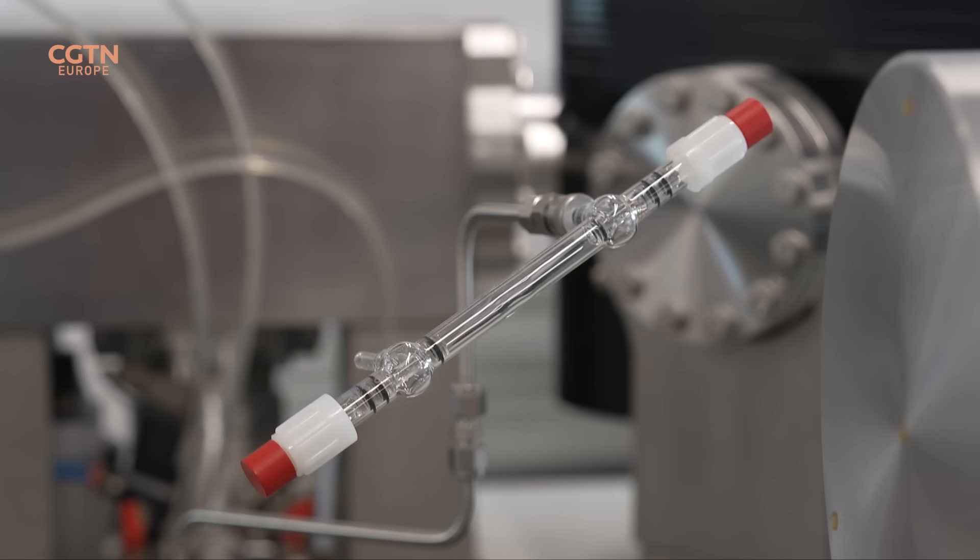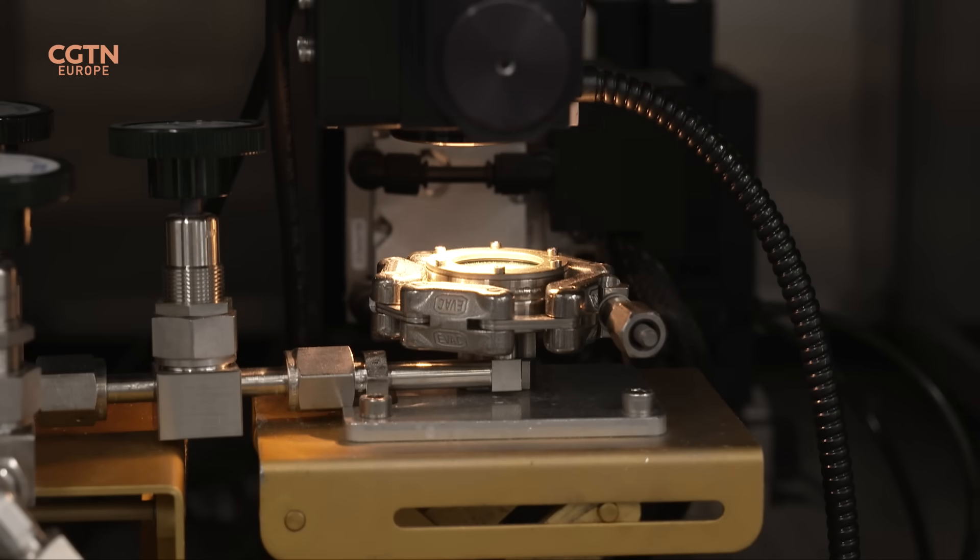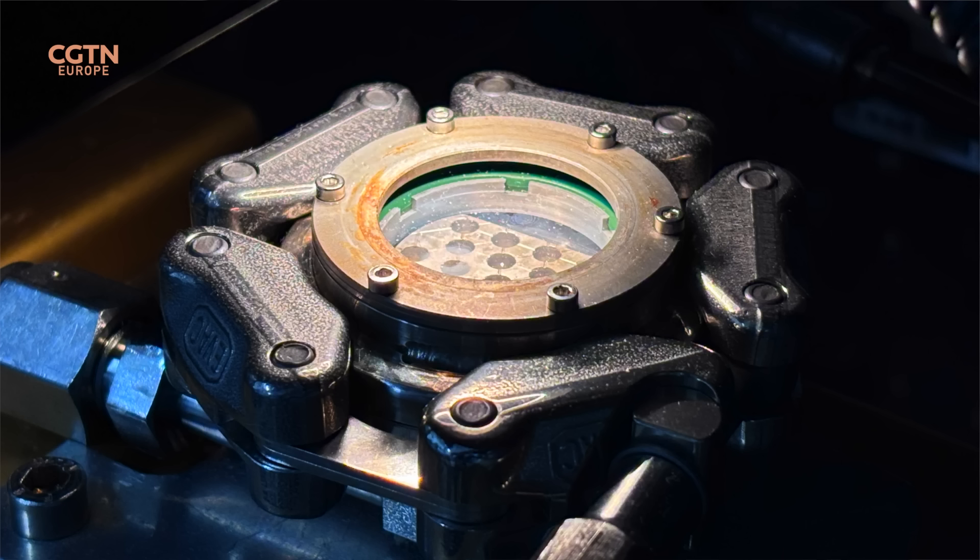In short, what it does is it introduces small amounts of moon dust and reacts that moon dust in the presence of a chemical compound called Bromine Pentafluoride. You use a laser to heat the sample up, and it extracts any oxygen present in the sample. Oxygen has three main isotopes: Oxygen-16, 17, and 18.